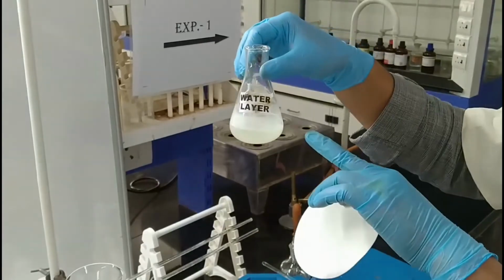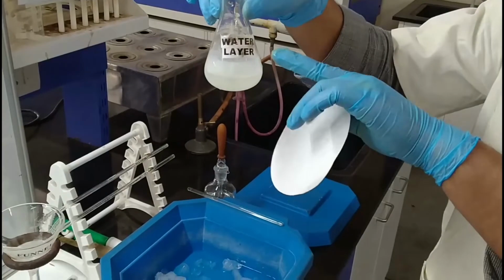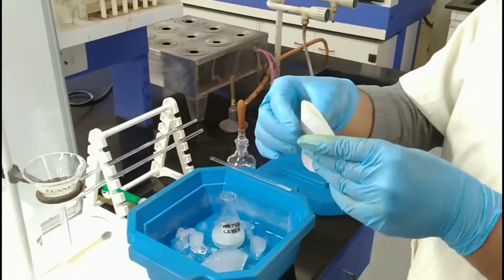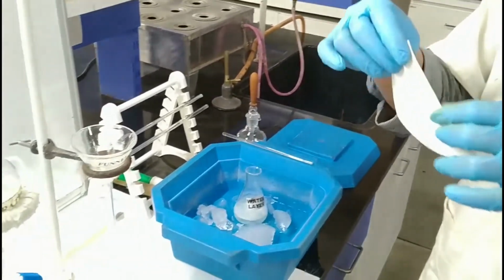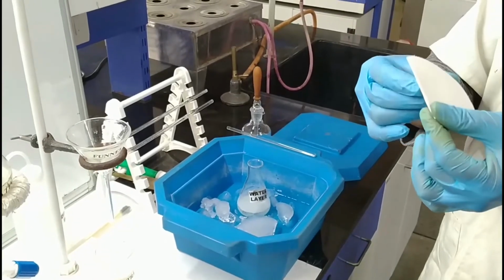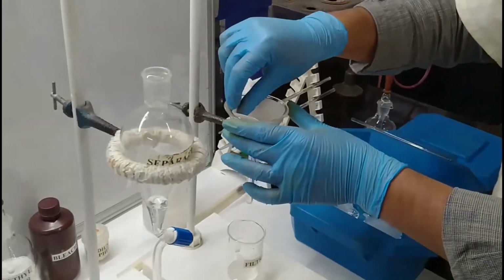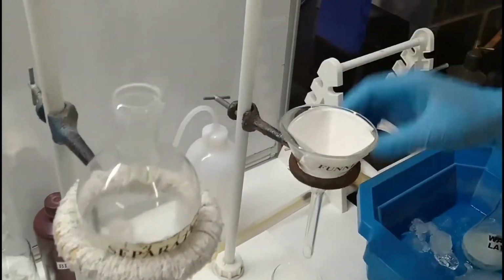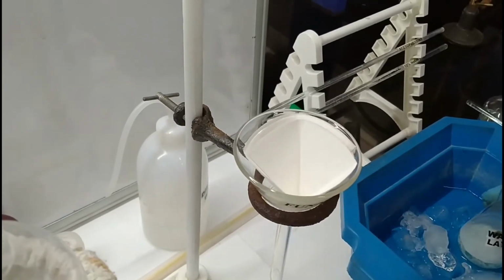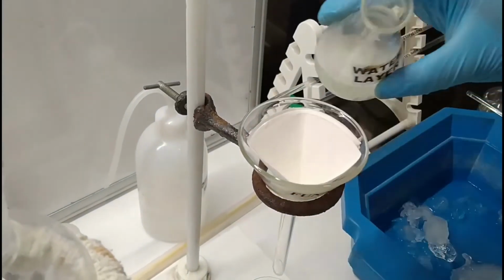So you can see the white thing. All these white things are the benzoic acid. Now what do we have to do? We have to filter this benzoic acid. For that, a filter paper is required. You have to fold the filter paper this way and fit it into the funnel like this. Now we are going to transfer the whole aqueous layer into this funnel.